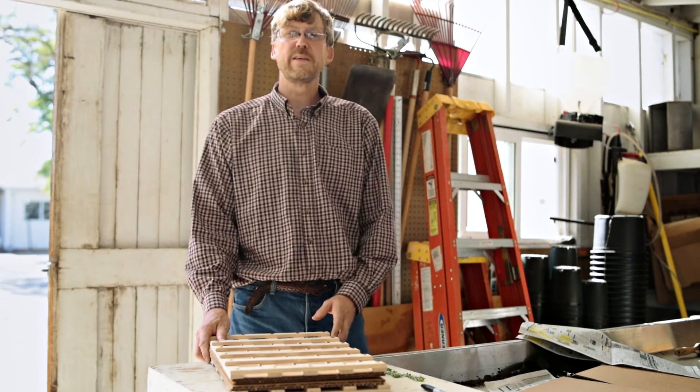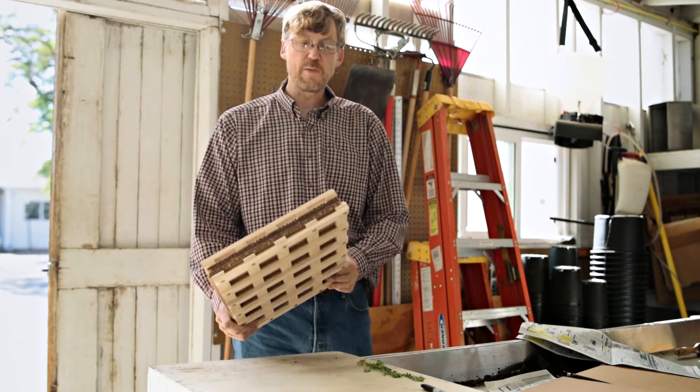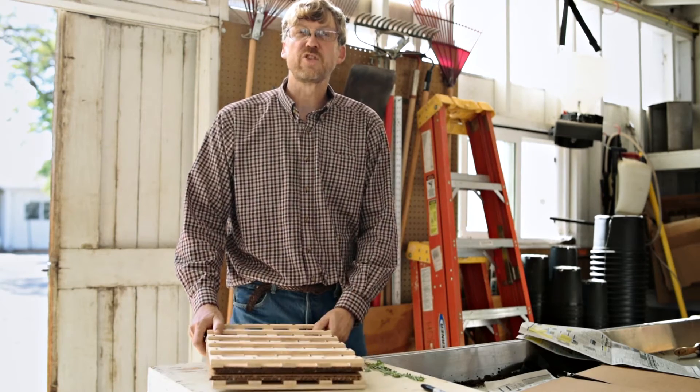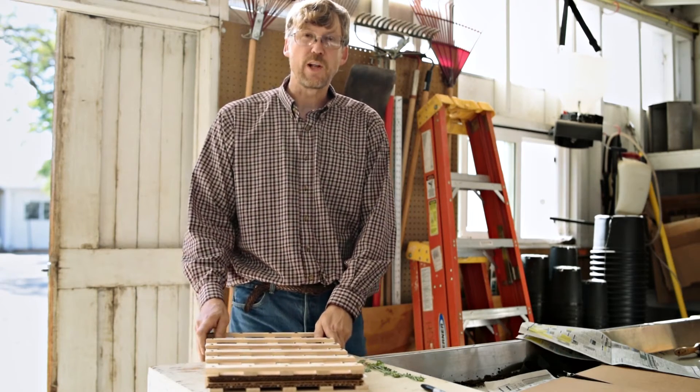Now let's talk about how to press plants. This is a commercial plant press — it costs quite a bit, but you can also make a much simpler version yourself at a very low cost.